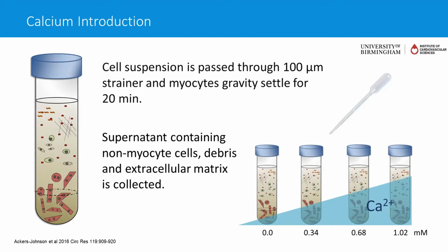Matt? Yeah, I think it's an interesting point, because what you don't want is that pellet to be there so long that hypoxia sets in, right? Which I think is what you're getting at here. Yes. And I guess that's the same reason why you use a 50 ml Falcon rather than a 15. Yes, it's narrower, so therefore a thicker pellet forms. Yes. We actually use 15 ml Falcons specifically because the angle at the bottom of the tube is steeper.